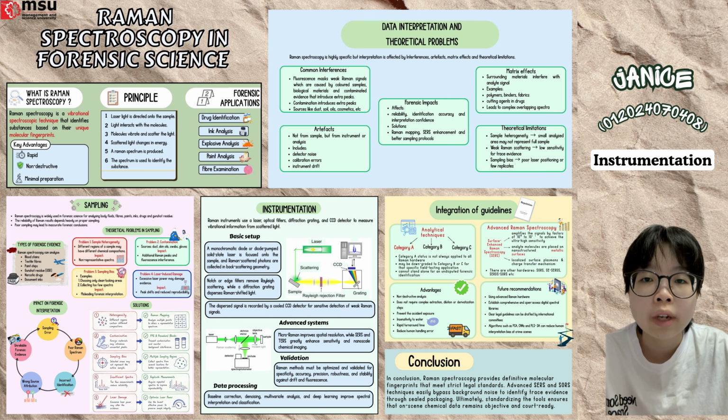Modern Raman instrumentation also includes software and advanced data analysis, since Raman bands are often weak and overlapping. Steps such as baseline correction, noise suppression, and multivariate analysis are needed. More recently, deep learning models have also been applied for spectral preprocessing and classification, helping to improve signal quality and speed up identification of materials, pathogens, or even disease states.